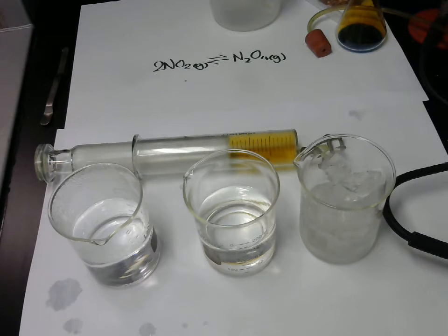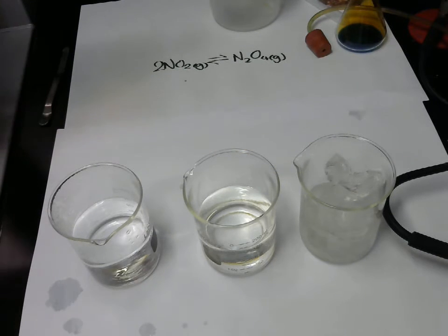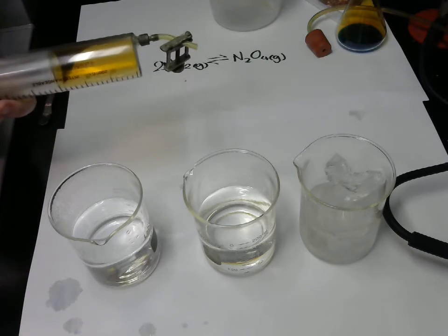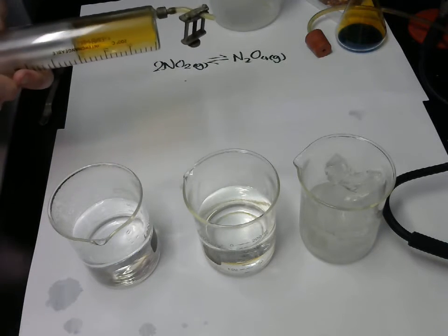Make what? What's it making more of? N2O4, okay? Because once I held it in place at higher pressure, it started to fade in colour a little bit until it created a new equilibrium position, which had more N2O4. Okay, so therefore if I reduce the pressure, so pull out on my syringe, what would we predict is going to happen first? It goes clearer because of the lower concentration.